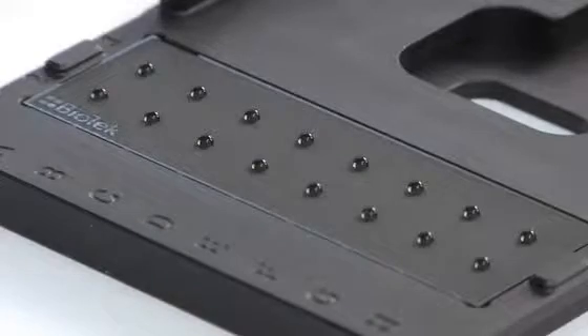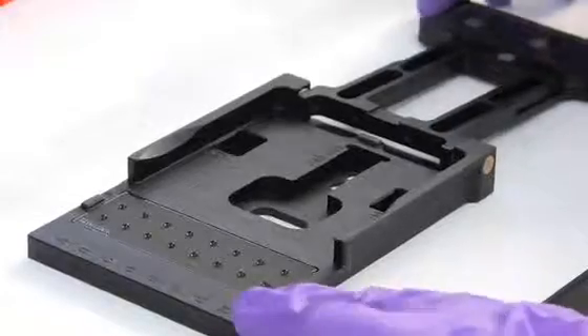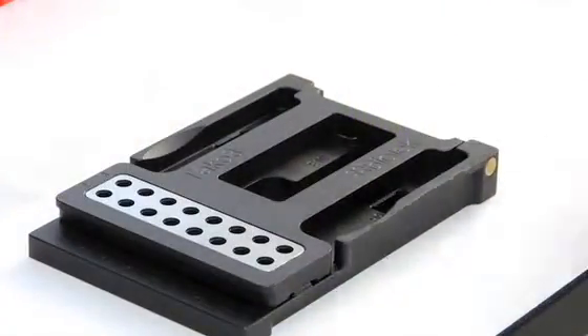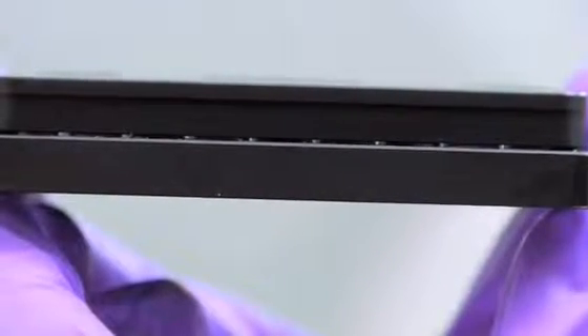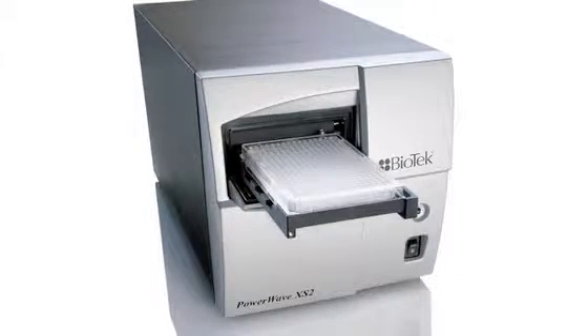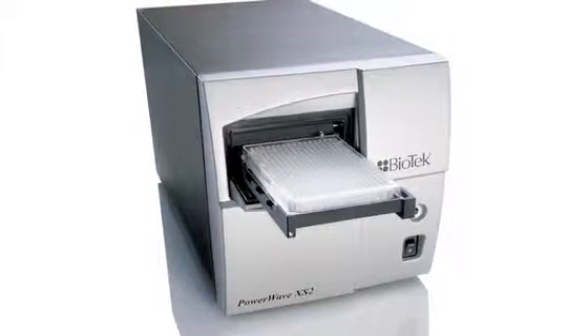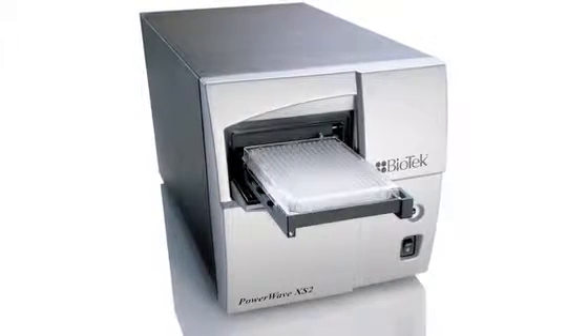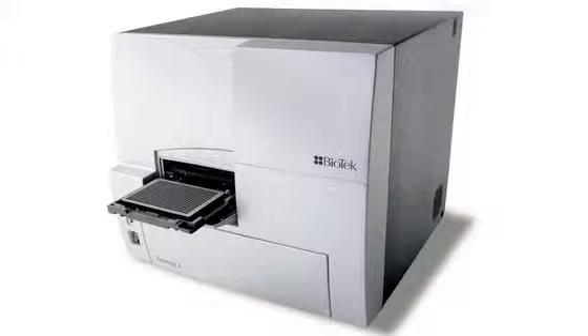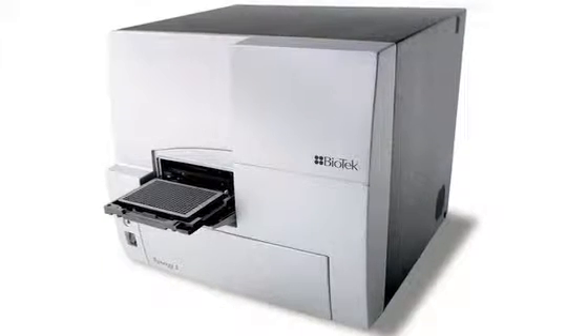The microspots are the ideal size for pipetting samples as small as 2 microliters. When the lid of the Take-3 is closed, the samples are sandwiched between top and bottom slides held to a nominal 0.5-millimeter path length for each microspot. The absorbance of the samples can be measured using any Biotech microplate spectrophotometer, and the fixed path lengths allow rapid calculation of concentrations based on a standard 1-centimeter path length.